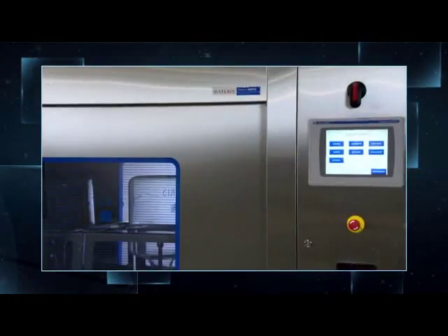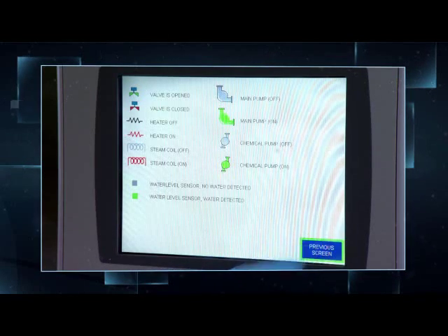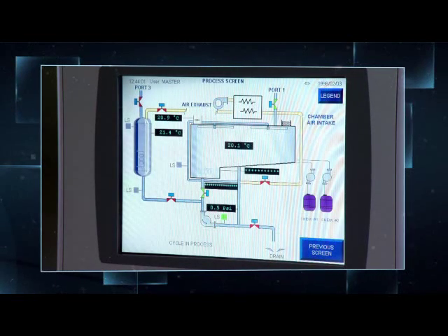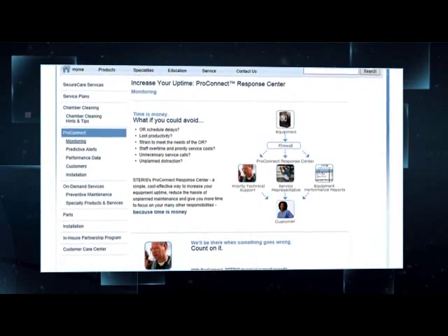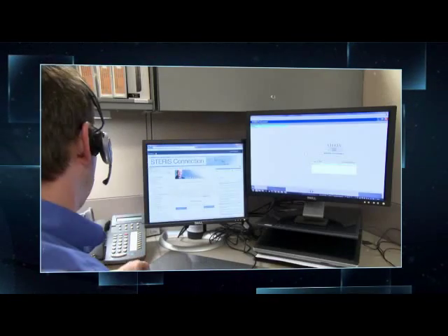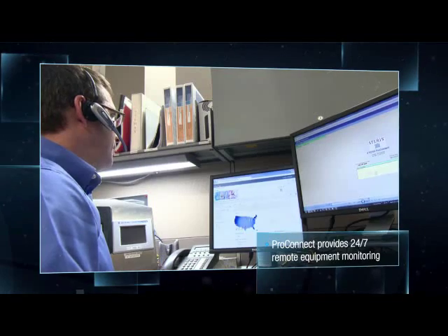The 480PG washer's advanced PLC control makes it easy to operate the system and monitor critical system parameters, and it can also be connected to the Steris ProConnect response center. ProConnect provides 24/7 remote equipment monitoring, helping reduce downtime and lower maintenance costs.